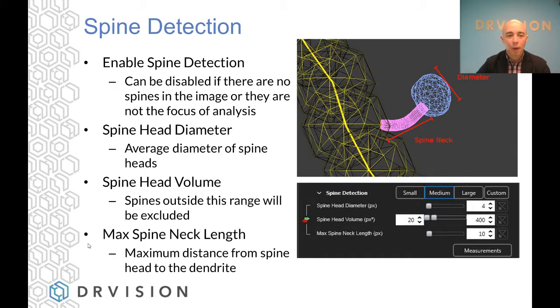And lastly, I promised we'd talk about spine detection, so here it is. We can enable spine detection, or if you're not concerned with them, you can disable them to save a little bit of time in the analysis process.